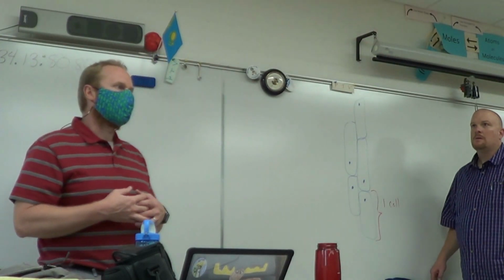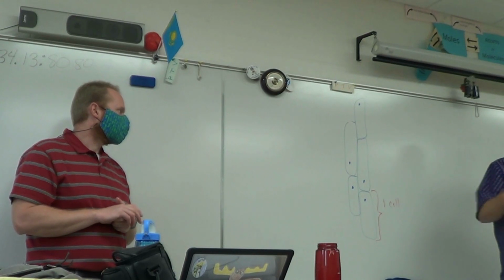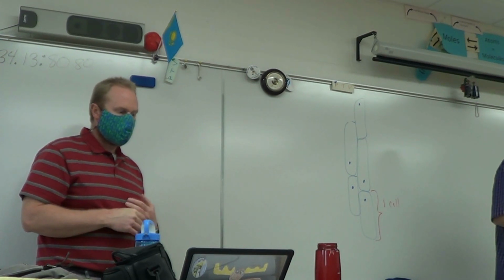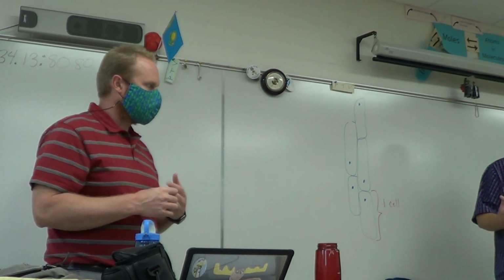And then we ask you to label some parts, and depending upon what we are looking at, depends upon what parts we're going to ask you to label. With the drawing, do the best you can. You're not going to get a lower grade because, well, your nucleus sure looks funky, right? It's not art class. But try to be detailed.